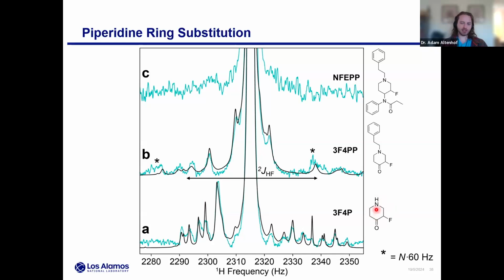I suppose looking at either of these cases, we do have to include the effects of that relaxing 14N nucleus. And then ultimately, when we got to the final fentanyl, this is kind of interesting for us. Clearly I'm not seeing any significant signals, not resolving anything. And this was interesting for us in comparing the precursor and the fentanyl. Notice I'm actually adding an additional proton here, so it's already that much more complicated a spectrum. And what's more, we now have 2 nitrogens with a 3-bond coupling to fluorine.